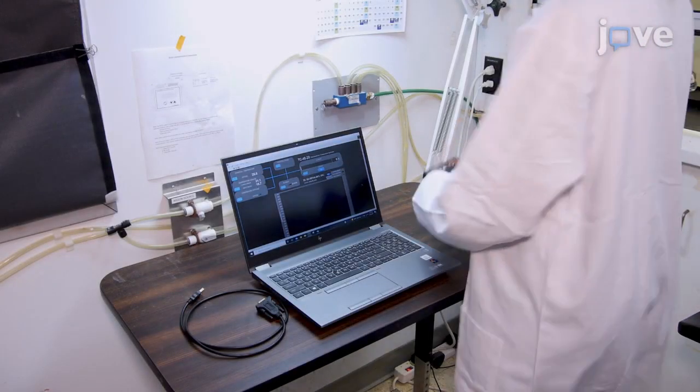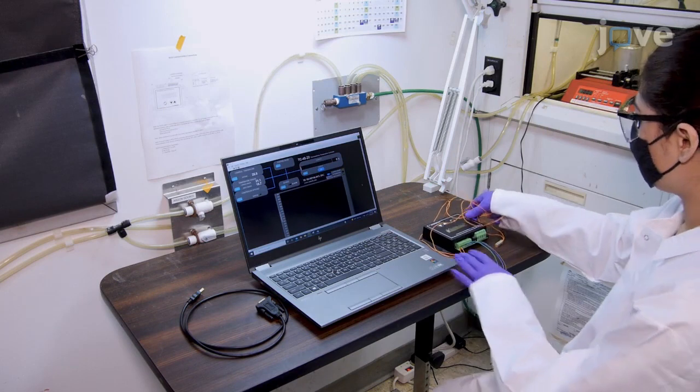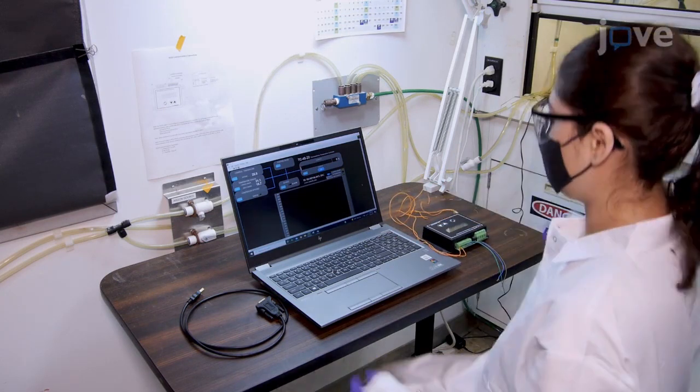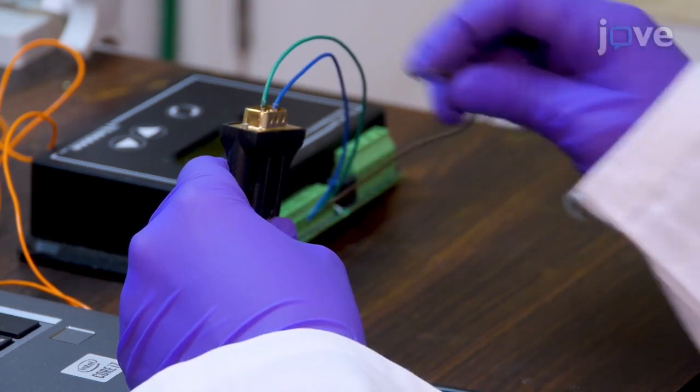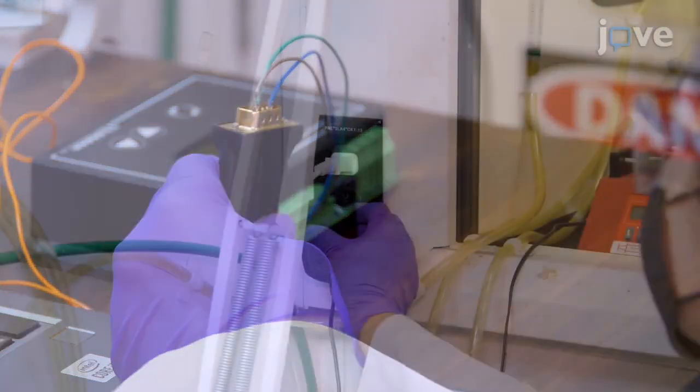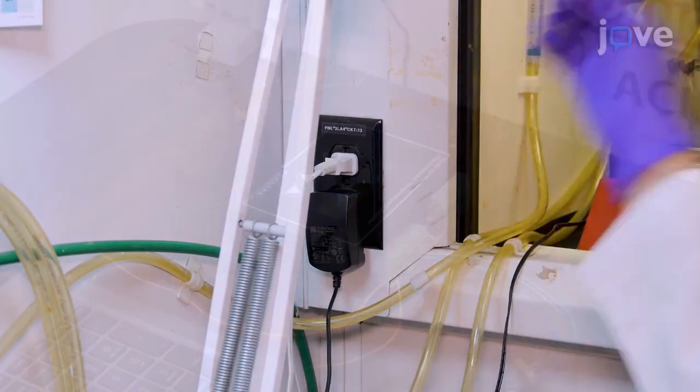Begin by placing the thermostore in a stable position on a side bench as close to the fume hood as possible. Insert the USB side of an RS-232 adapter cable into the computer USB port and plug the cord into a power socket.